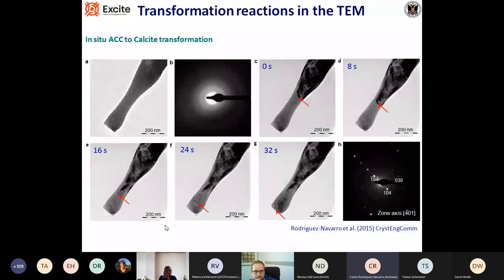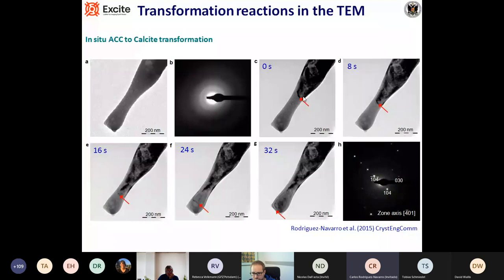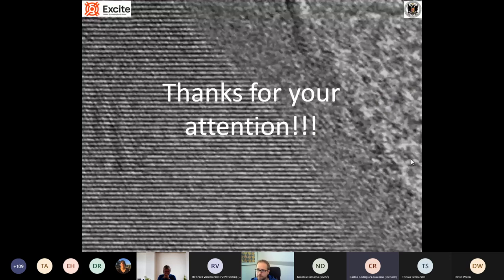We can also see an amorphous-to-crystalline transformation in the TEM. We start with an amorphous sample — here is the diffuse ring pattern — and we see the advance over time of a crystalline front transforming the originally fully amorphous material into calcite. Here is the final spot pattern for this crystalline phase. Thank you for your attention.